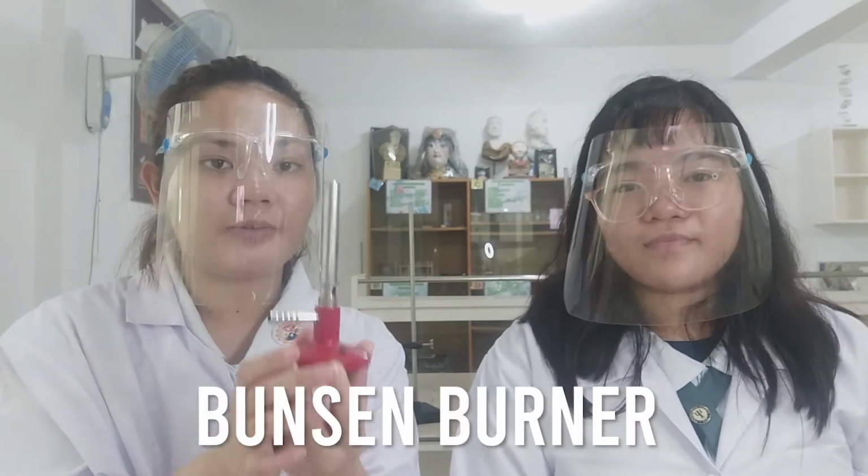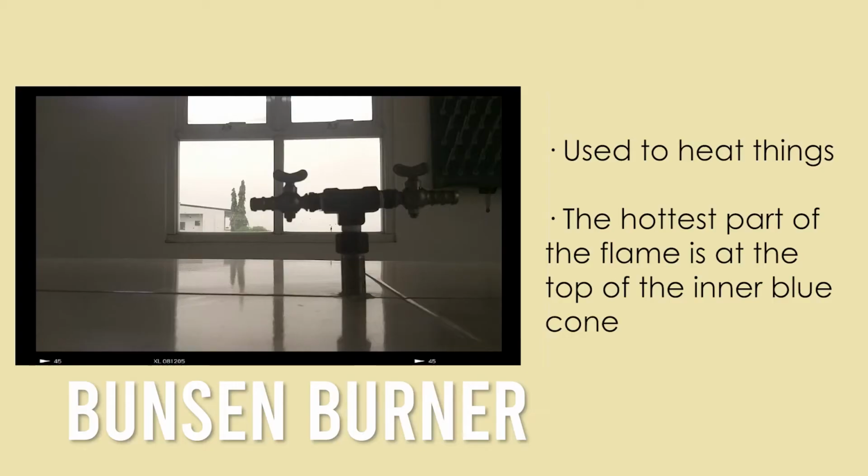When working in the lab, there are instances that we need to heat the chemicals in order for us to reach our reaction. For this, we have the Bunsen burner for us to be able to heat things.